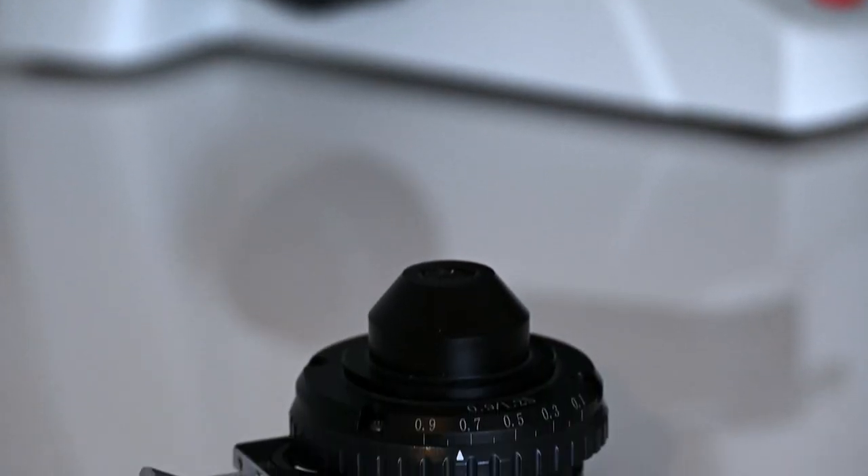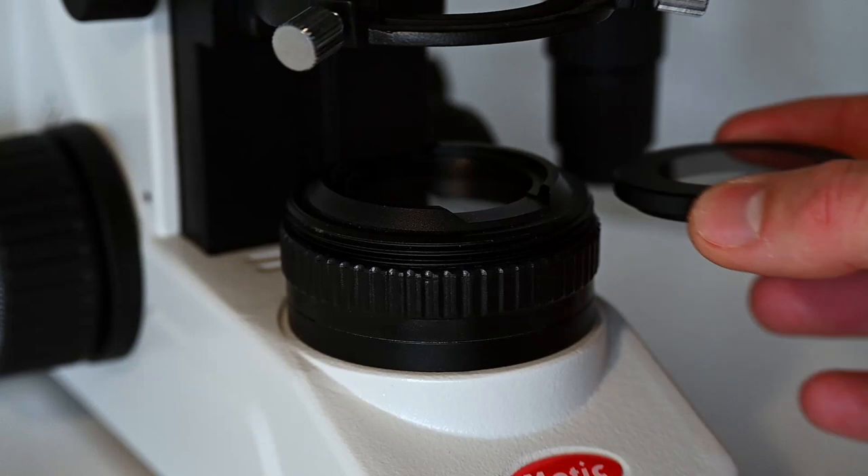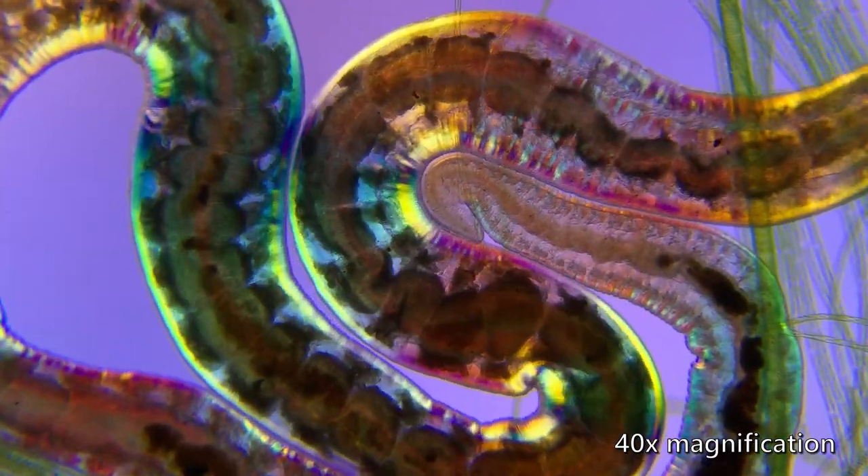Underneath the microscope stage is a condenser equipped with a filter slot. This allows me to do dark field microscopy and oblique illumination, and with the addition of polarizing filters, I'm also able to use polarized light to illuminate my specimens. All of these do not come standard with the microscope and need to be added separately, and I will of course explain all of these techniques in a lot more detail in future videos.